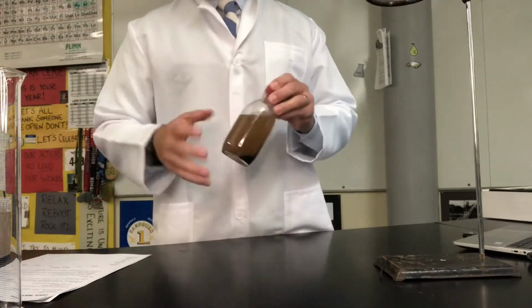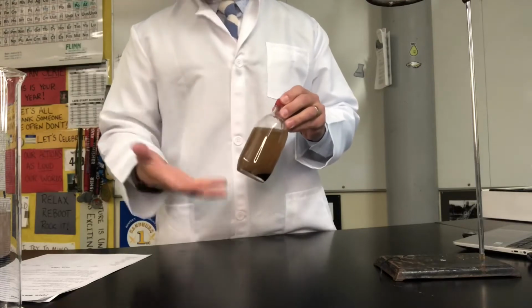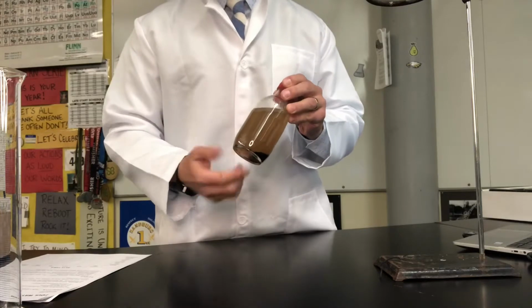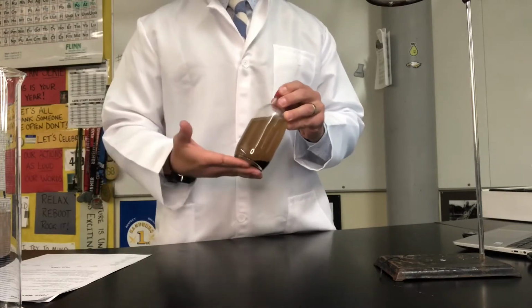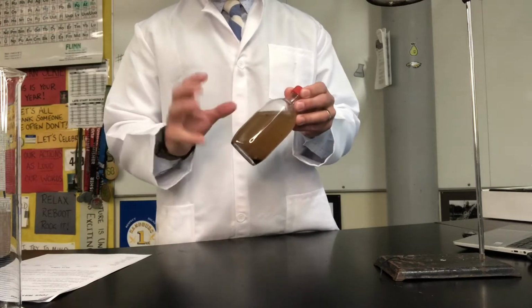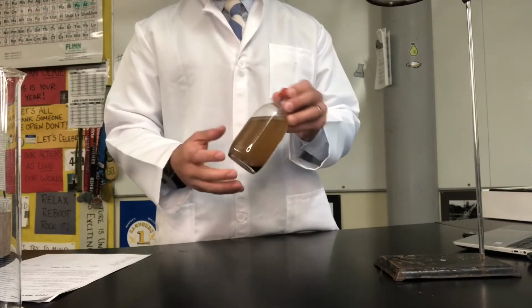Now, we're going to take some observations, mention its physical properties, and we're going to slowly try to clean this water through something we call physical separation. So to do that, the first thing we need to do is kind of get our pulse on this liquid and see what it's like.